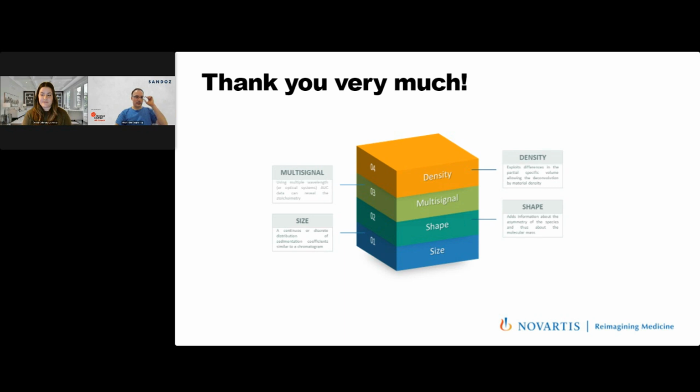Right, that's an excellent question. And this is also something where we put quite some effort in there. In the first experiments, we went for a high A260 absorbance because that's what we did before for single wavelength. But then of course at 230 you have an OD of 1.8 or so, which is not what you like. And the data I've shown here and also the data we have published are such as described by the colleague. We went for an OD of around 0.8 for A230, and consequently, of course, I only have an OD of 0.3.